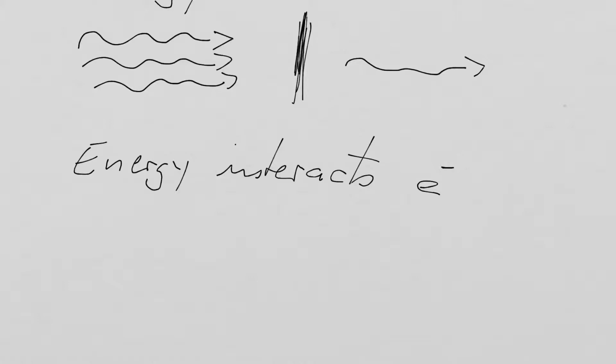In BSA, the electrons are more difficult to excite. They are tighter bound around the nucleus. So we need light with more energy. That's why you used ultraviolet light, which has more energy than the light that you used for the paranitrophenol. So the big thing is you always have to use the right light if you want an interaction between energy and matter.